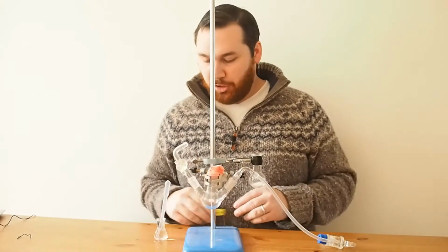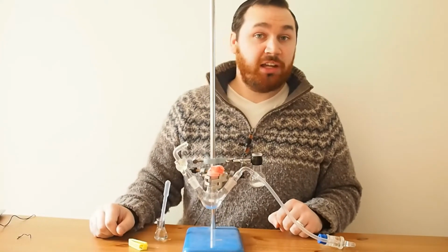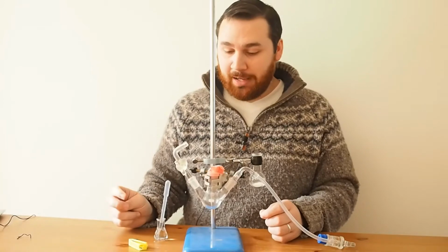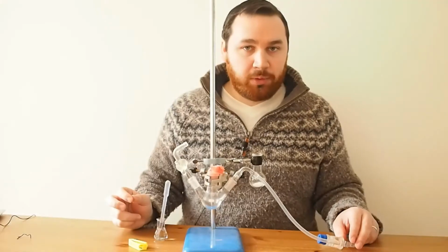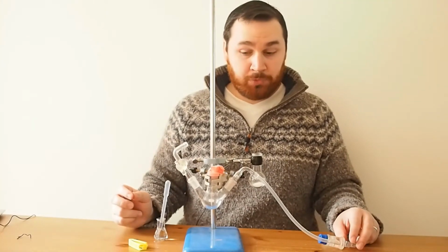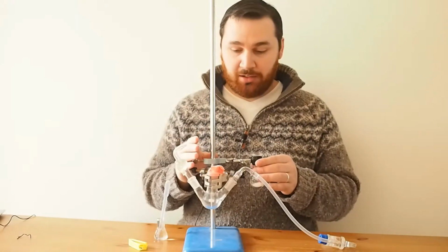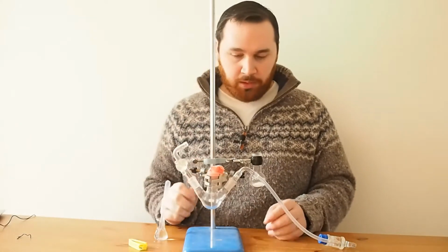Now, in a laboratory, we can deal with that quite easily, where we can just use nitrogen. Have a nice dry nitrogen atmosphere, or argon, because it's not very reactive. But I'm going to show you today, using this apparatus, how we can set up a system where we can work under carbon dioxide. So we can get rid of all the air in our system and replace it with carbon dioxide, or displace it, I should say, because you're pushing it out.